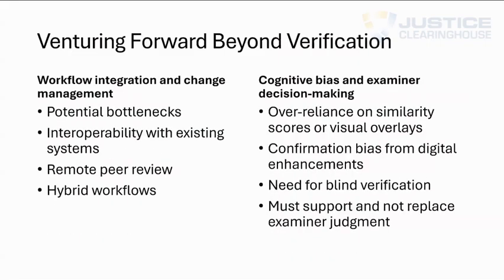And then there's workflow integration and change management. There are going to be potential bottlenecks, and we have to identify what those are going to be. We have to consider interoperability with existing systems, including our LIMS. There also has to be a consideration for remote peer review. What is that going to look like? And then hybrid workflows, because there are some things that virtual comparison microscopy just won't handle as well, or as efficiently maybe, as light comparison microscopy.